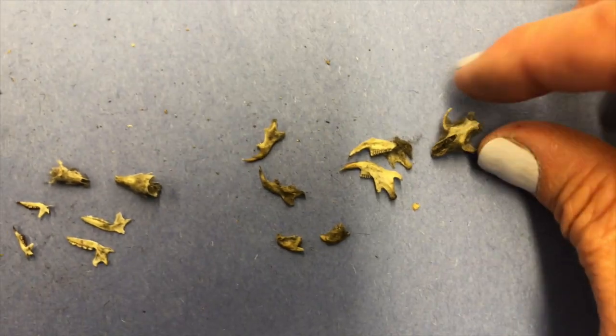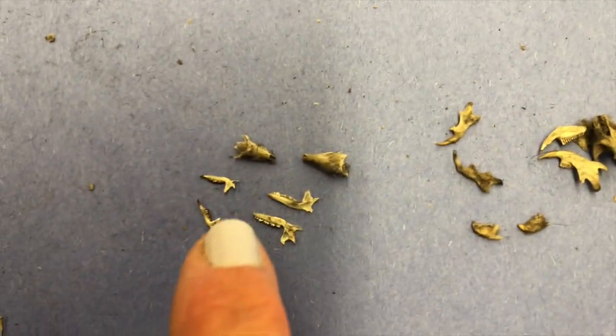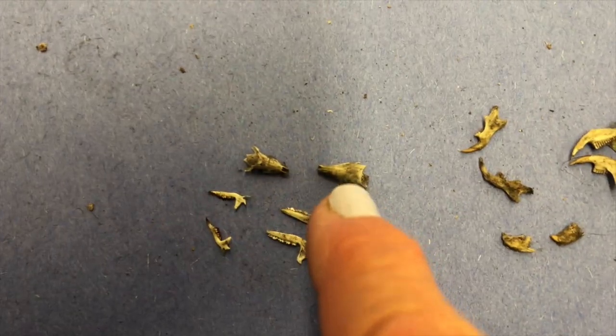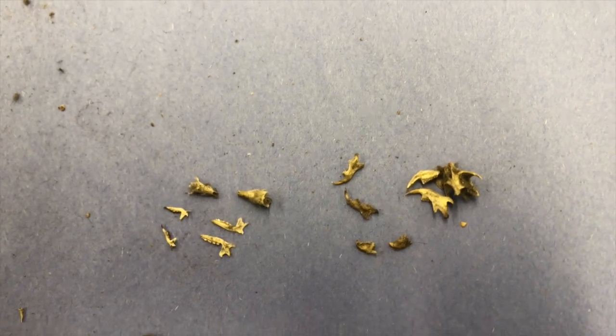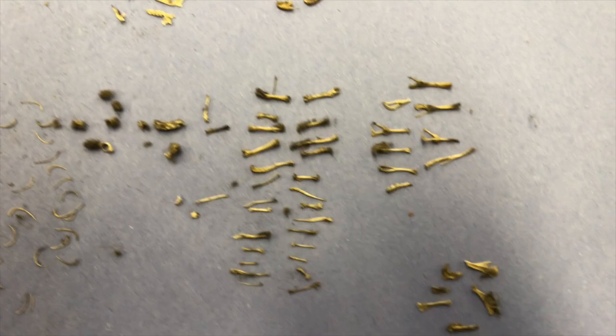This one is very curved, and this one is long. So I think it's a shrew, and it has the skull and the lower jaw. So that, to me, means I've got 5 rodents that were in this one owl pellet.